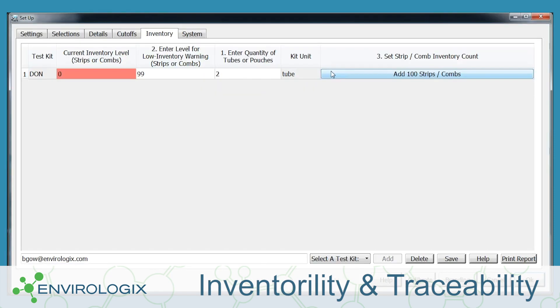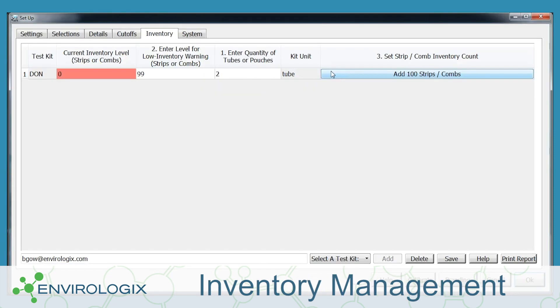By entering data when you purchase kits, Quick Scan can help manage inventory, keeping a running count and reminding you to order more.